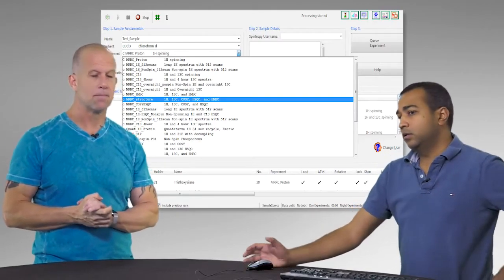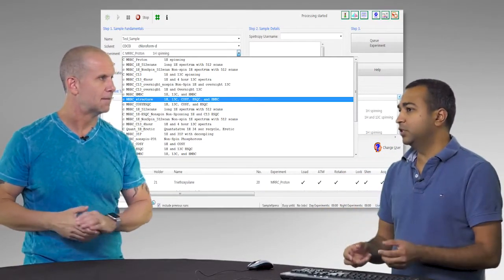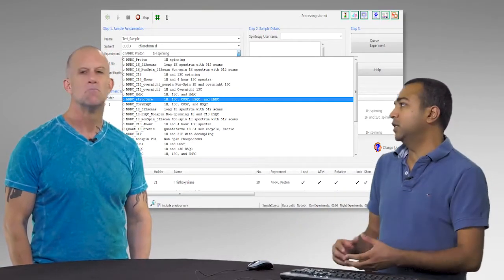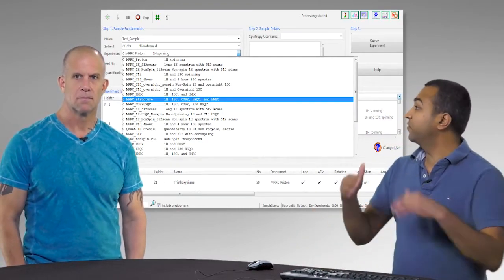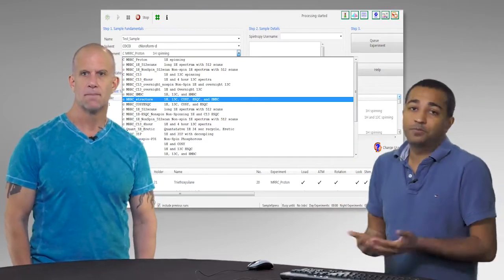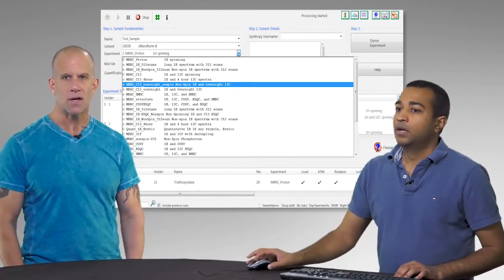As you'll see on Spintropy, it actually gives you little bits of information that let you know this is an HSQC or this is a 1D proton experiment. So it's not that you won't be able to differentiate them later, but this makes it easier because you don't have to specifically put in different file names for every single experiment. You can see the top experiment is the one that people run most, just a simple proton.